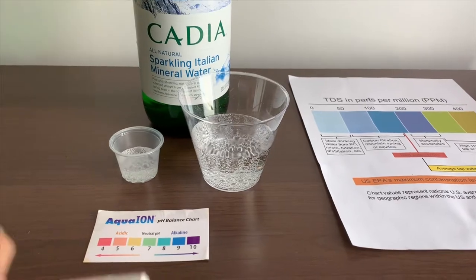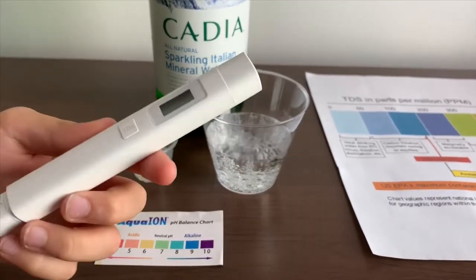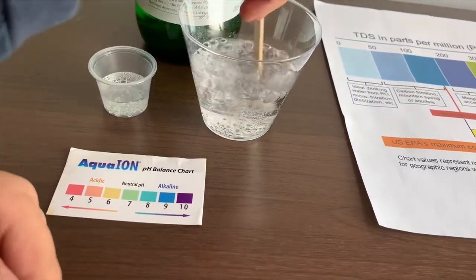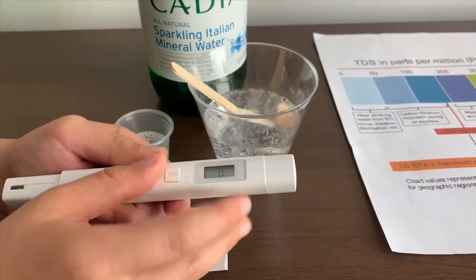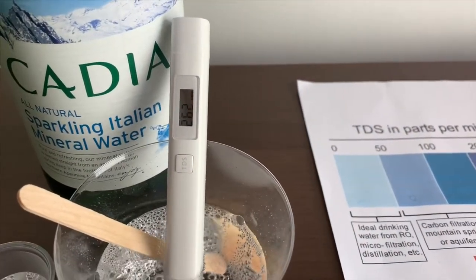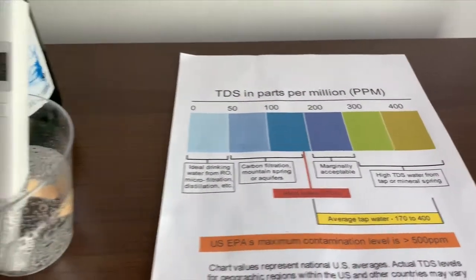First, we're going to test the TDS level. If you want to buy this TDS tester, check the link down below. Let's stir it so we'll get a better result. Turn on the TDS tester, make sure it says zero, and put it in. It's in the 200s. That is average tap water.